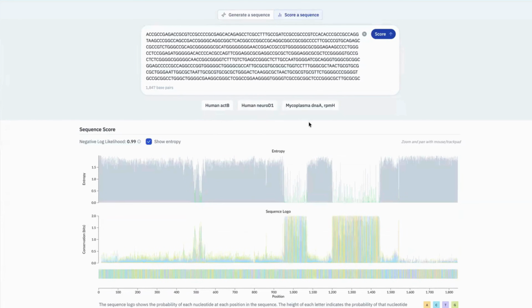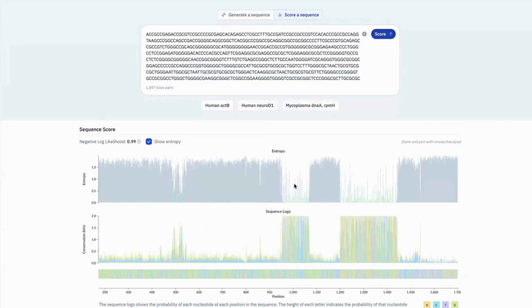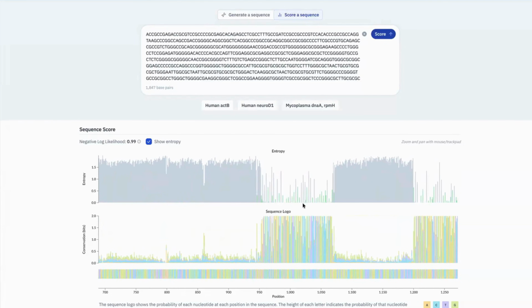You can also stack a per base entropy score visualization on top of the sequence logo. While the sequence logo shows what nucleotides are preferred at each position by way of presenting the probability of each letter in that position, the entropy clearly shows how strong that preference is, something that you can also tell in the sequence plot when viewing the high stack regions. Entropy and sequence logo are complementary views. For positions where entropy is less than 1, we color them green to draw attention to the highly conserved regions. The higher entropy regions appear in gray.